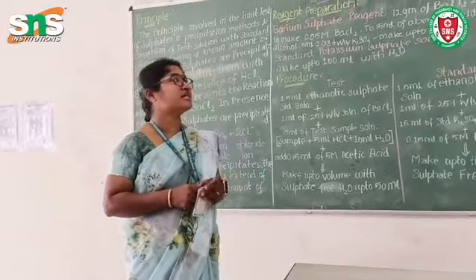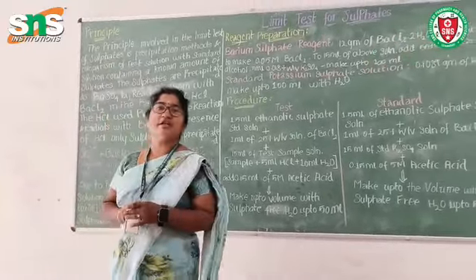This is an important question and this is the limit test for sulphate.